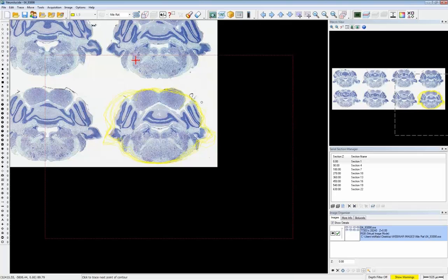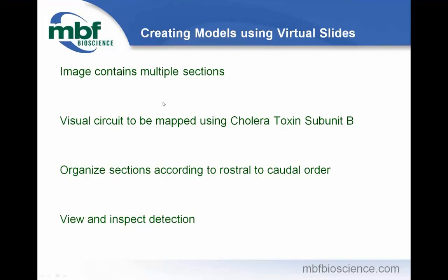Since these sections here are very close together in Z, so it's every third section, so they're only 90 microns apart, we're not going to demonstrate 3D visualization with this particular demo. We're going to do a demo of that a little bit later on. Okay.